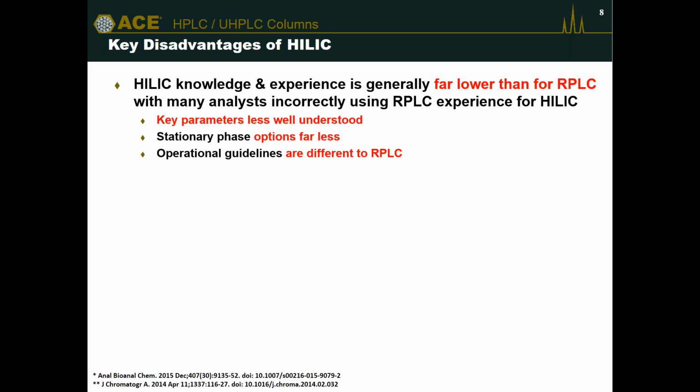Typically, it is much, much lower than for reverse phase chromatography. Many of the guidelines and principles that we apply every day for reverse phase chromatography, running methods, doing method development, need to be different for HILIC. And if we try and apply the reverse phase LC principles to HILIC, it can lead to poor chromatography, poor reproducibility, and people getting very frustrated with the technique.